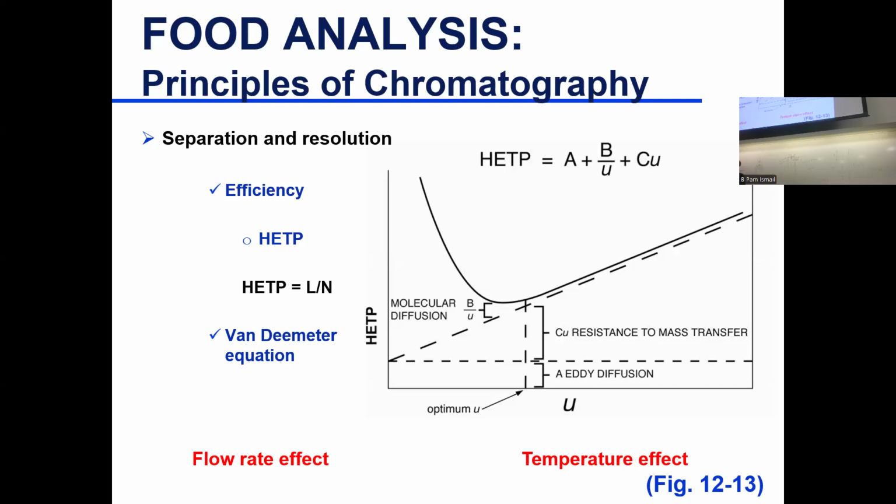Which one will cause your solutes to just travel within the stationary phase rather than in and out? The 0.1? Yes, absolutely. The slower your flow rate, the more problematic it's going to be, and you'll have more diffusion in the column, wider peaks.